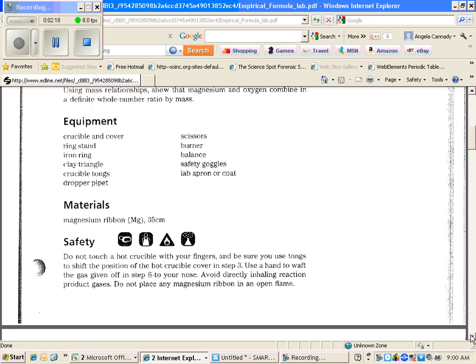Crucibles get very hot, and they're not like Pyrex. You know how Pyrex, you can take a hot object and set it down on your table. But a crucible is not protected like that. It's not heat resistant. So you need to make sure that you don't take the crucible from being hot to cold very quickly. It needs time to cool down. Another thing is, you can't tell when it's hot and when it's cold by looking at it. So be careful.